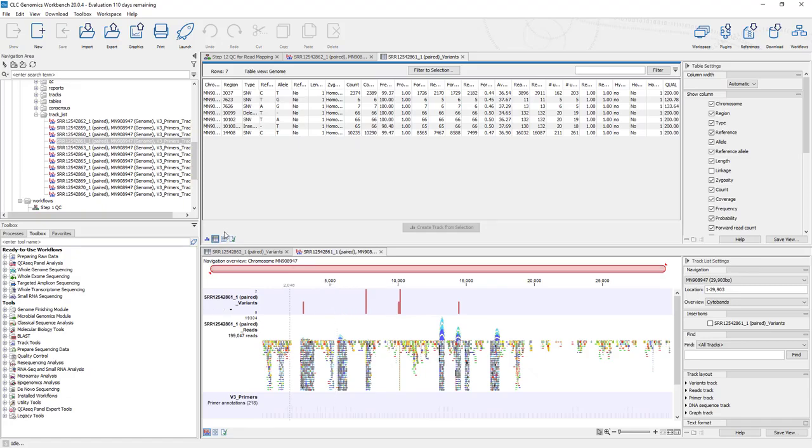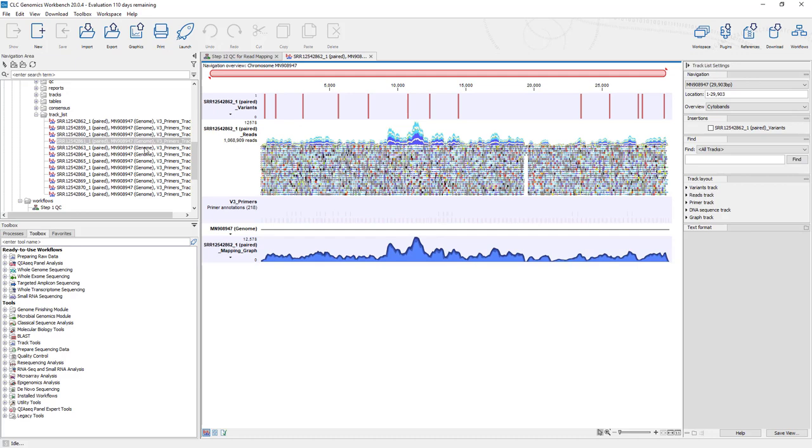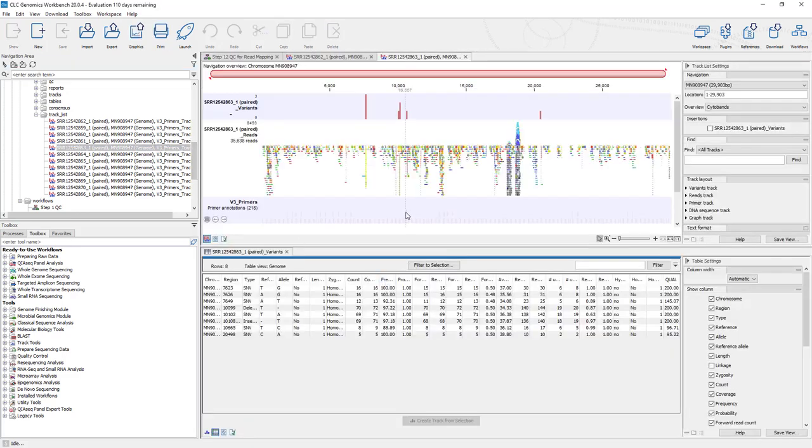And for each specimen, you can go in and look at how these results are for each individual specimen, whether it passes, fails. But wouldn't it be nice to create a workflow where instead of having to go in and look at each one of these individually, sit here and open up one after another and look at the results, wouldn't it be nice to look at an entire run and all the variance on one view, all the coverage graphs on one view, etc.